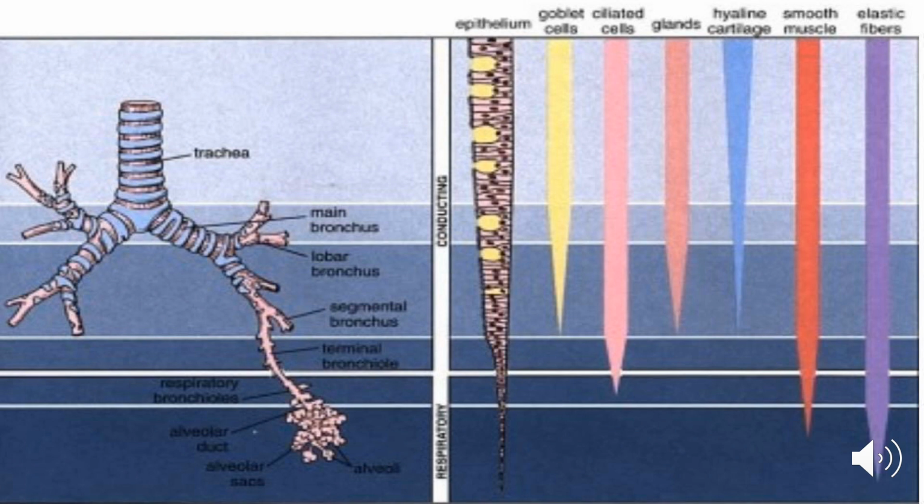We will talk about the hyaline cartilage support of the walls of the organs that belong to the lower respiratory tract system. As stated in the photo, the size and the number of these cartilage supports will decrease. So expect to find large and abundant hyaline cartilages at the trachea compared to the bronchi. Now, it's very important to take note that there are no more hyaline cartilages present at the levels of the bronchioles and the alveoli. The question now is, since you know very well that the cartilage functions to provide support, what will now provide support to the bronchioles and alveoli, given that they don't have any cartilage supports anymore?